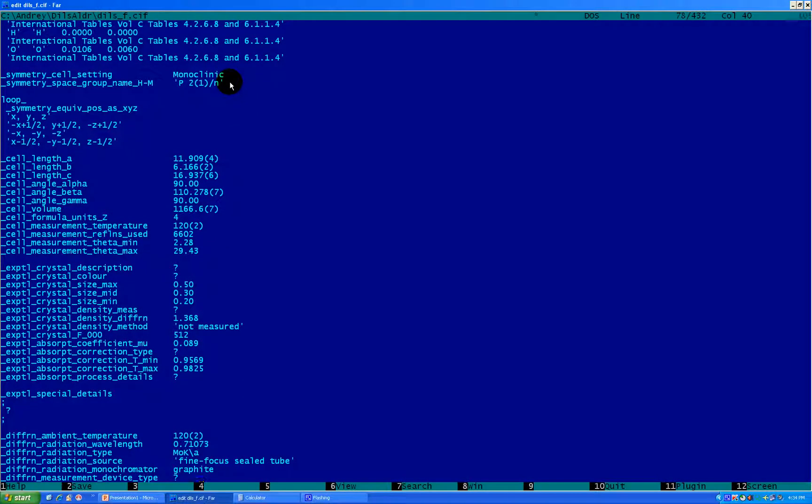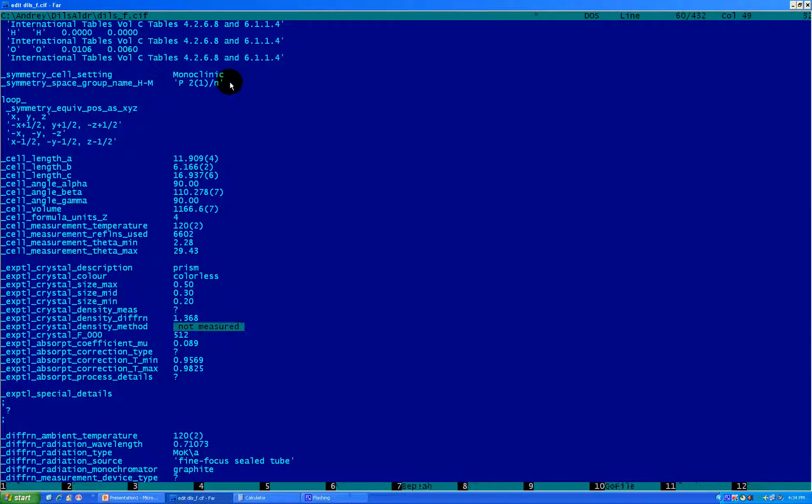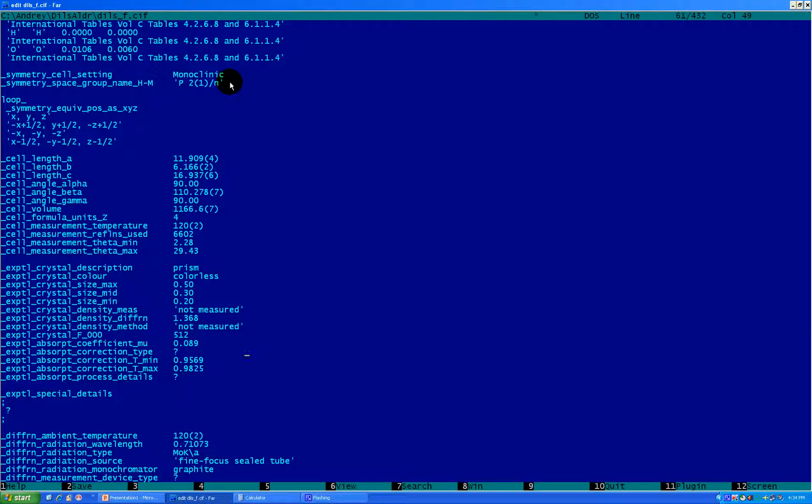Now information about the crystal. Crystal description - it was prism. Color - it was colorless. Absorption correction type - did you measure the crystal density? No, we didn't measure it. So I'm copying it from here, saying it's not measured. Next thing, absorption correction type. In this case I use SADABS, which is standard for Bruker software package. So it's multi-scan absorption correction. Multi-scan.